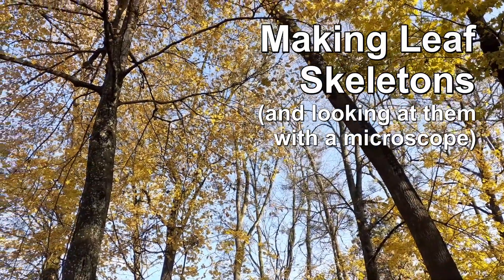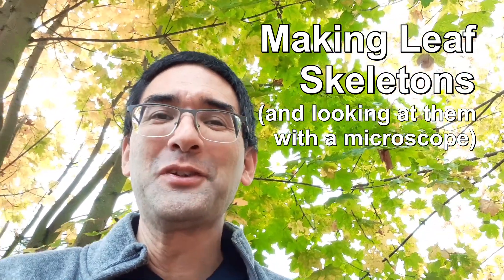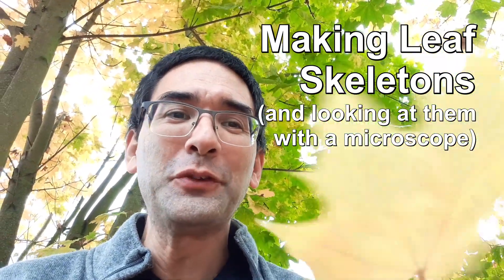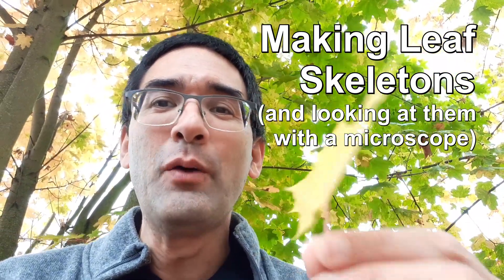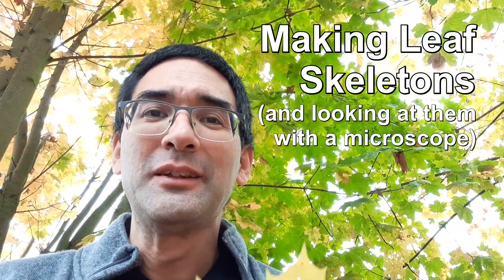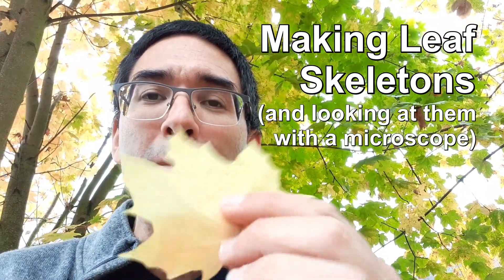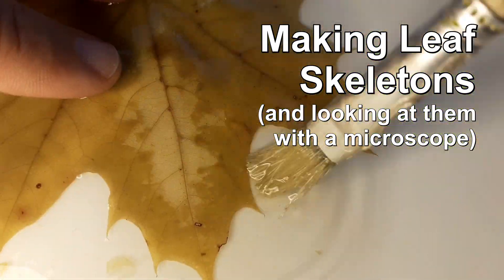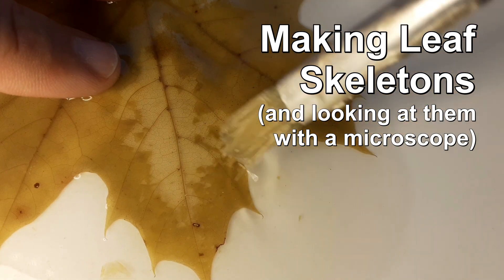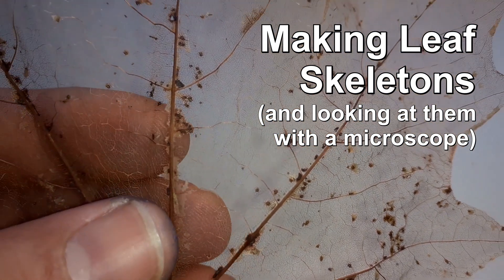It's fall. The leaves are falling from the trees and I've got a maple leaf here. Behind me is, of course, the maple tree from where I've got this leaf. What I want to do today is I want to put this leaf under the microscope, but I'm going to do so in a slightly different way because I'm going to show you a method on how you can prepare the veins of the leaf, and I want to remove all of the other tissue so that I only have the veins left over.